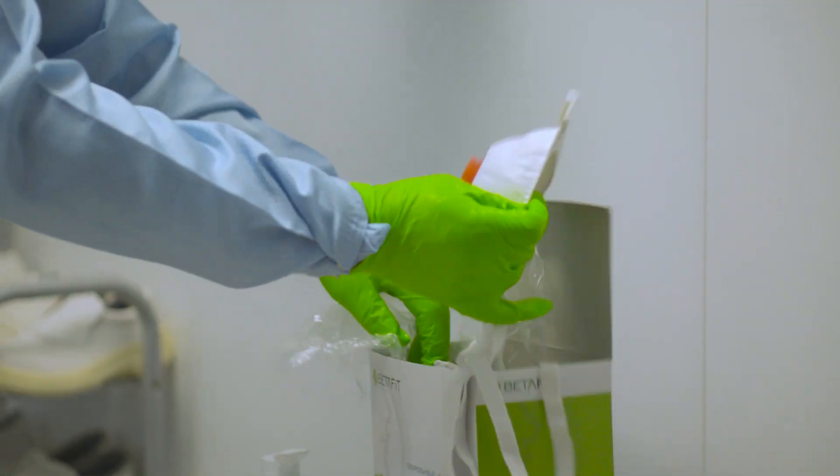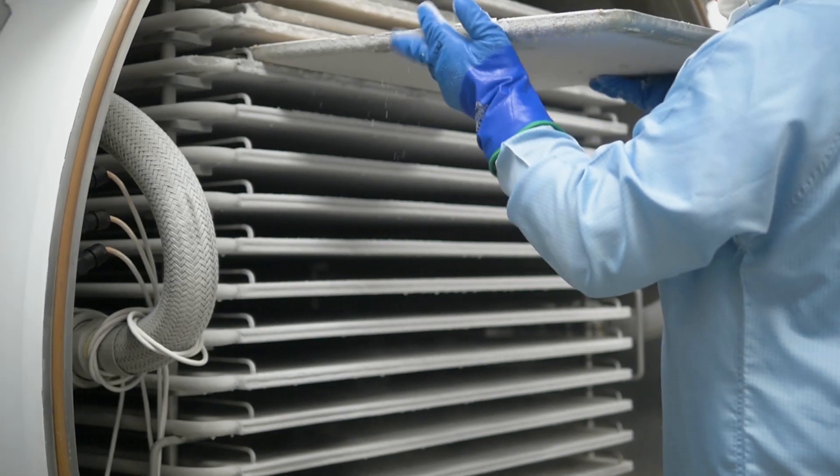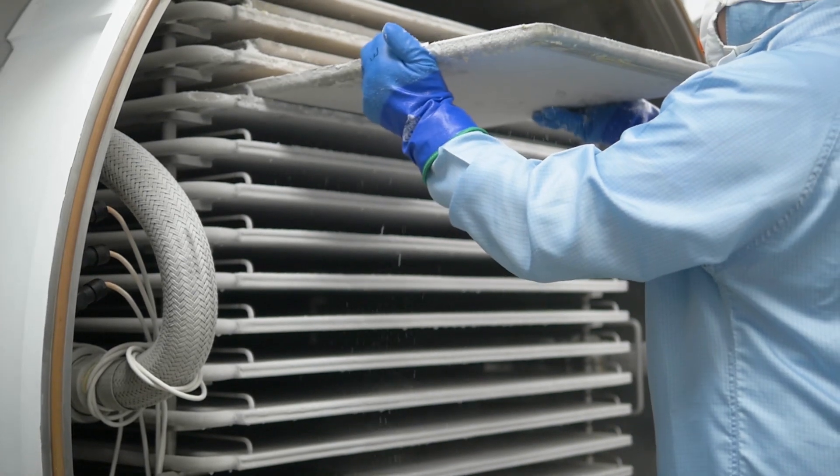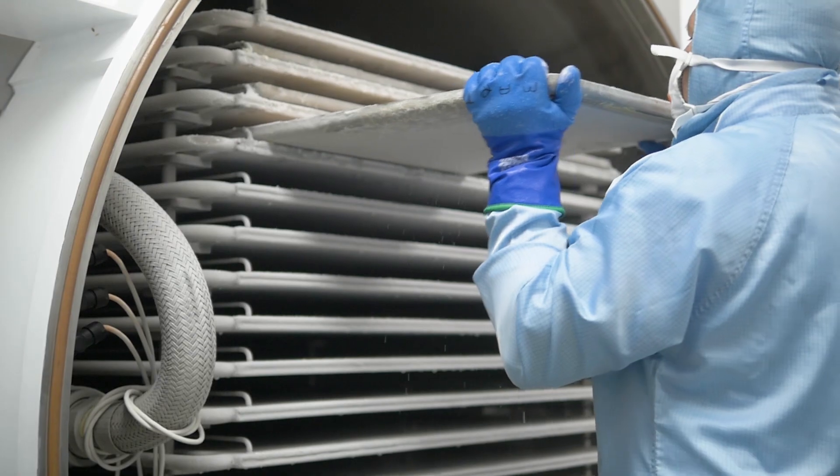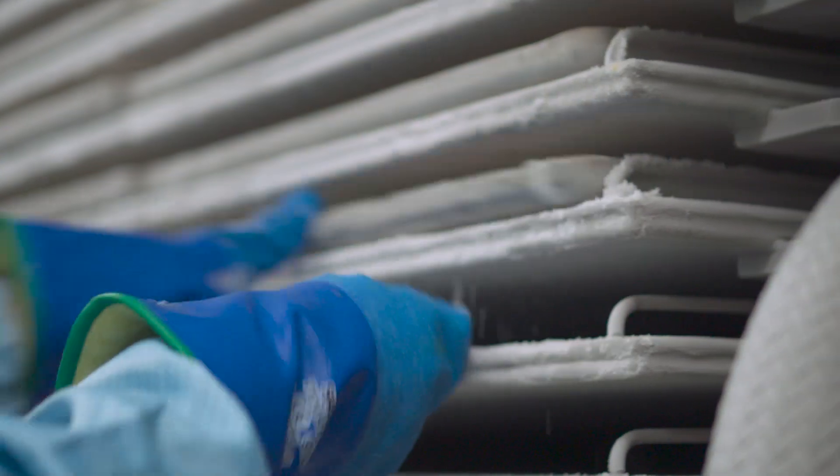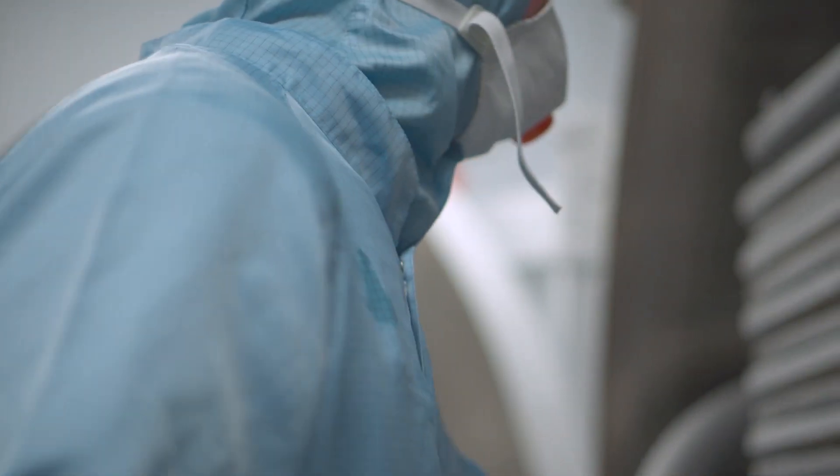Freeze drying is a dehydration process typically used to preserve perishable materials such as bacteria. This process consists of freezing the bacterial paste, then reducing the surrounding pressure. This allows the frozen water in the material to sublimate directly from the solid phase to the gas phase. This means the bacteria paste dries without exposure to high temperatures, something that can easily damage bacteria.